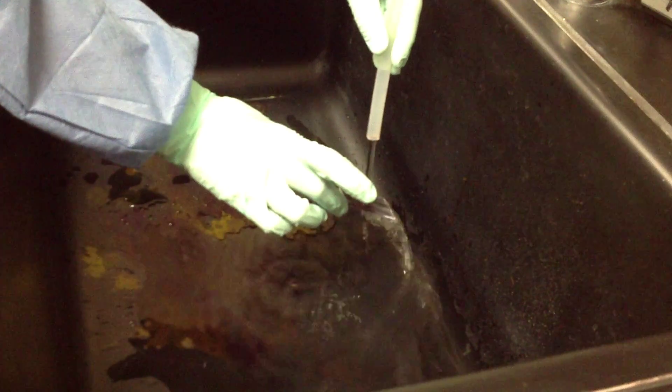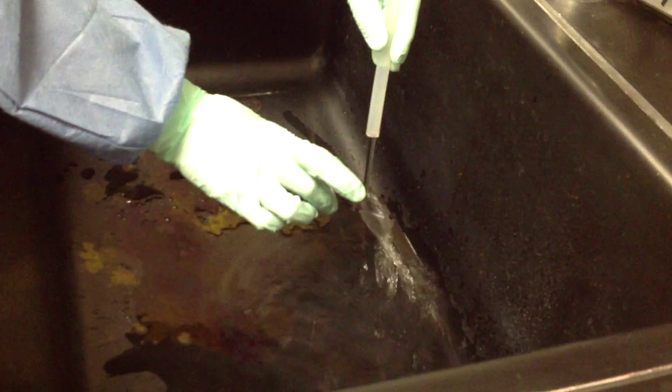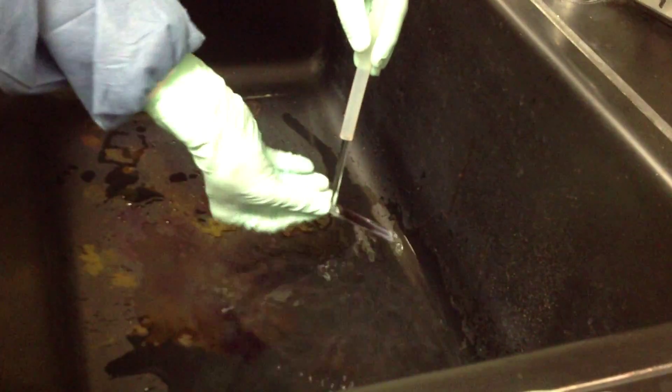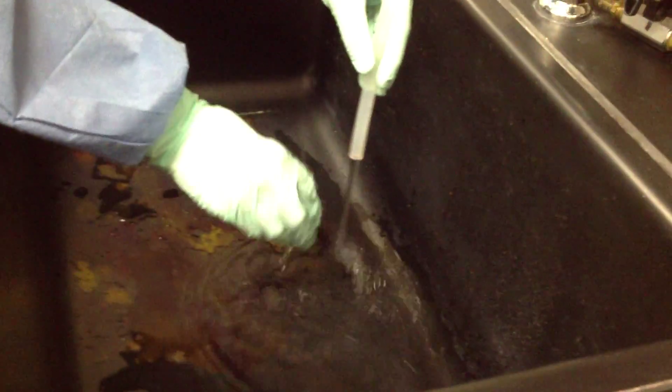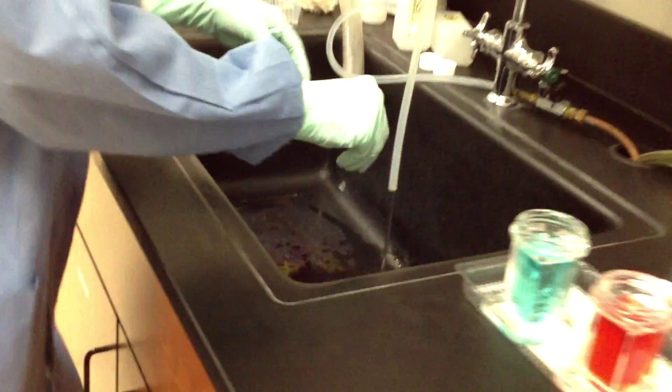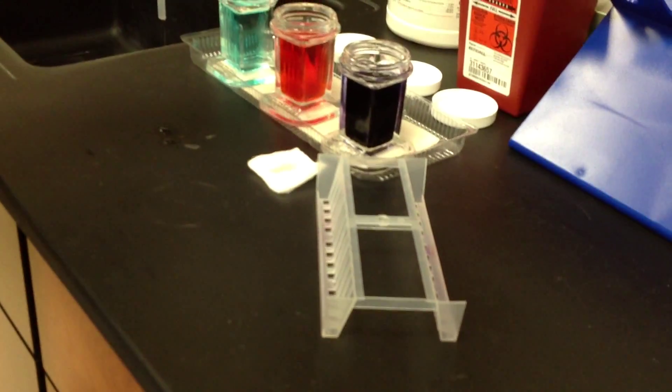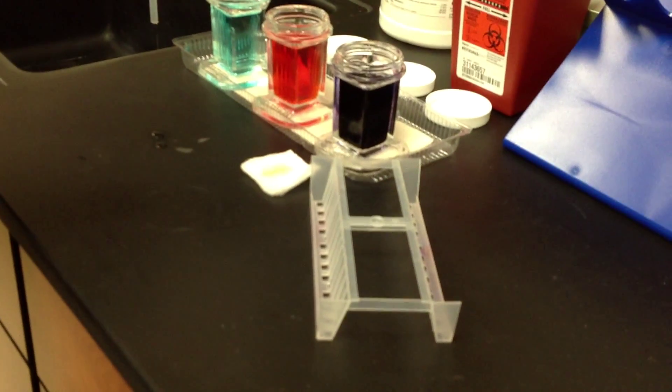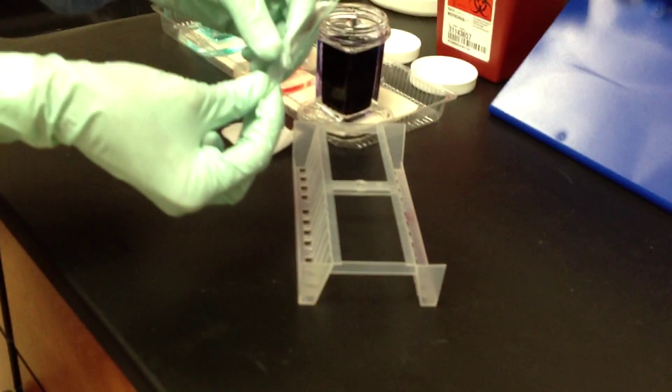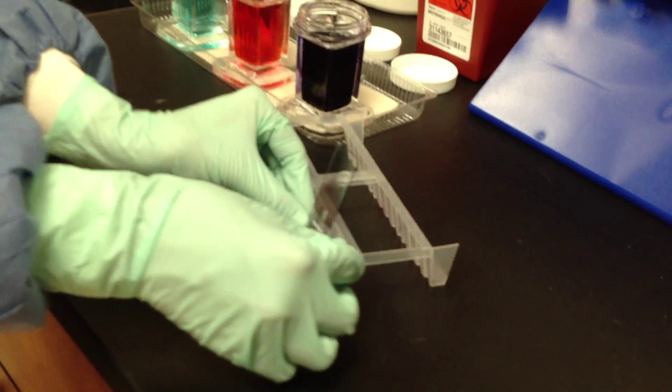At this point, you never want to blot again. It will make an impression on your blood smear and ruin it for you. We do want to hold it up on the end briefly, and we're going to set it label-side down in our drying rack. Now we have our stained slide.